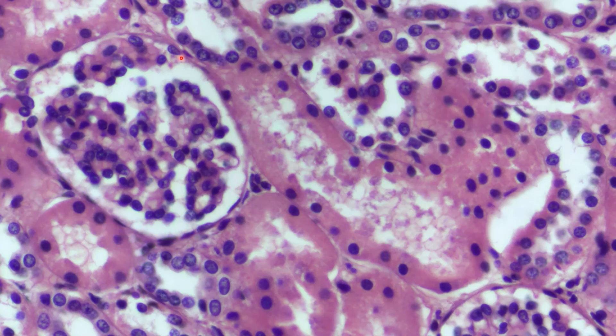This is also lined with simple squamous as seen in the kidney.